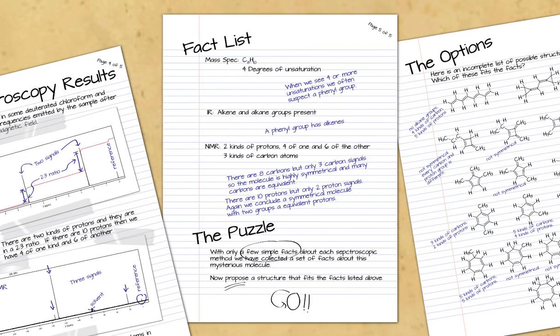All right, let's make a fact list. And this is what I highly recommend you do, no matter what you're doing. Make a list of facts that you get from your spectra, and then throw away the spectra and use those facts to propose your final structure. And then when you propose that structure, go back to the spectra and look for the fine details that will confirm your hypothesis. But stick with the facts. Let's just do the facts first.